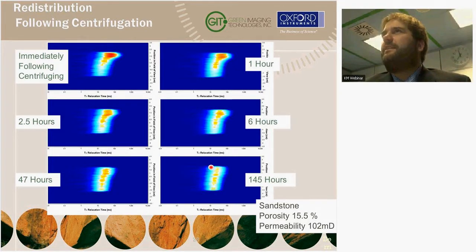So look at this end. This is preferentially in the larger pores as opposed to this end of the rock, and the rock is homogeneous. So this has to do with the centrifuge. It may appear it's at equilibrium, but I don't know whether this will ever equalize out. I haven't done the measurement after months, but you can see we can get information. It is applicable to many different types of flow studies, EOR studies, wettability alteration, in which you want to do this measurement.